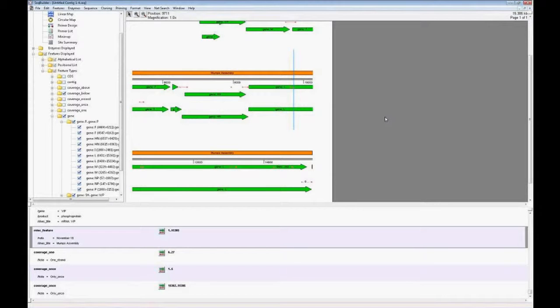So that concludes my de novo workflow. At this time, I can take any questions. Okay, Katie, we do have a few questions that have come in from our attendees about de novo assembly in SeqMan Pro. And the first question is, does SeqMan Pro support mate pair data?